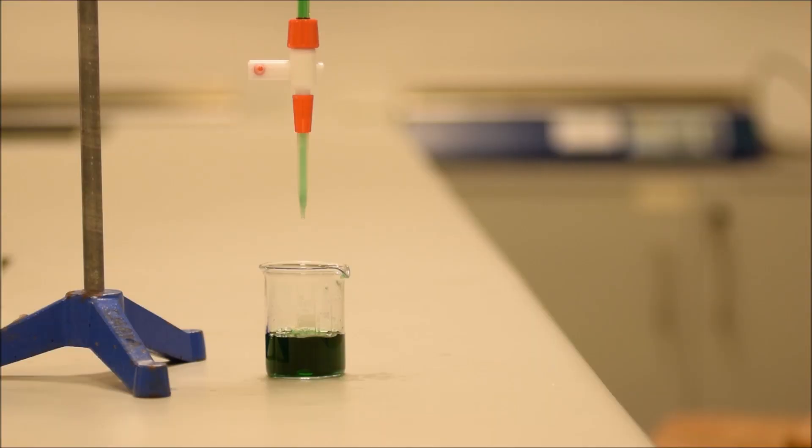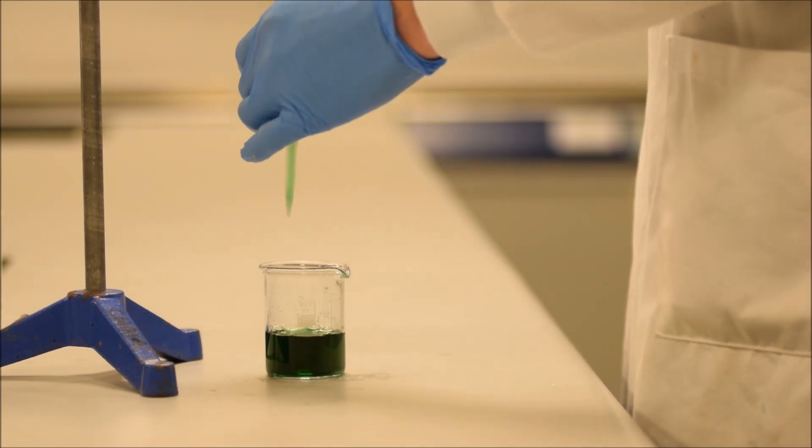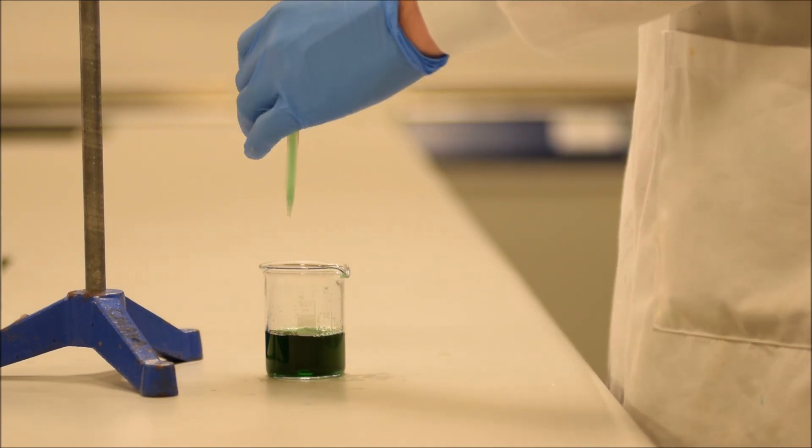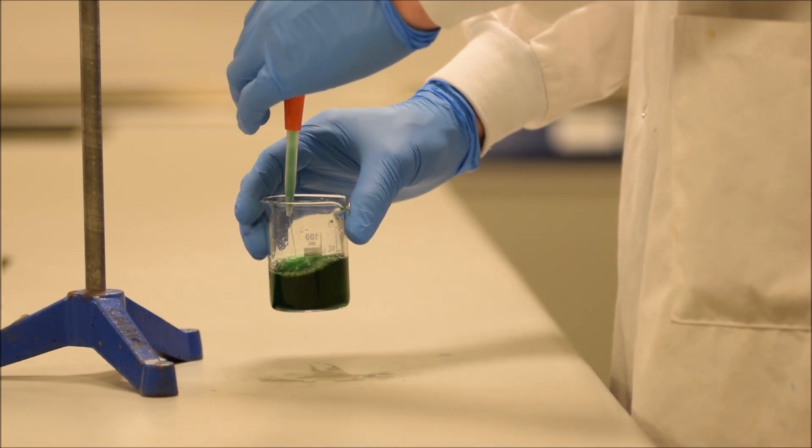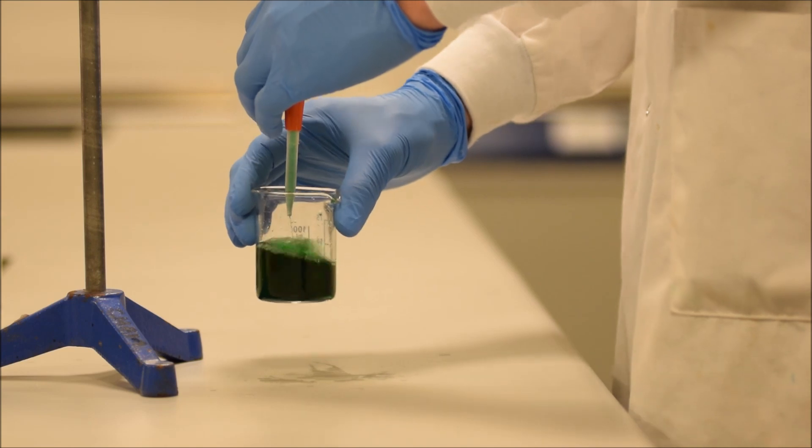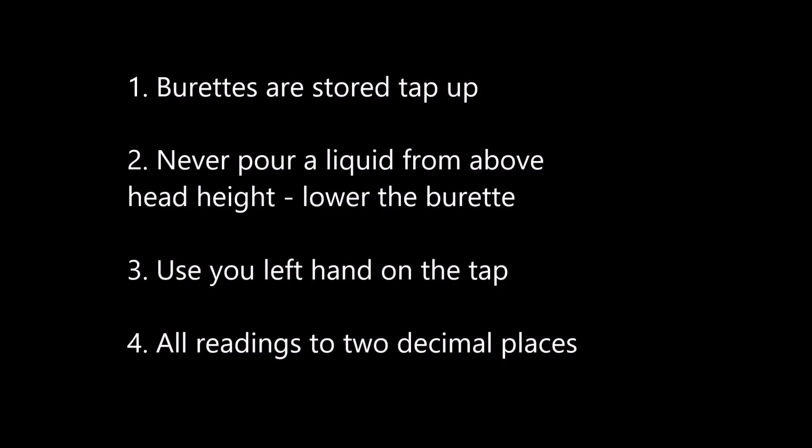It also means that your right hand is free for manipulating other things, and you'll often want to do this if, for example, say you're doing a titration, and you want to mix the flask as it goes, you'll want your right hand, because it's actually quite difficult to mix things with your left hand if you're not left-handed. So rotate the burette, use your left hand to open and close the tap, and then use your right hand to mix the mixture as you add in the material coming out of your burette.